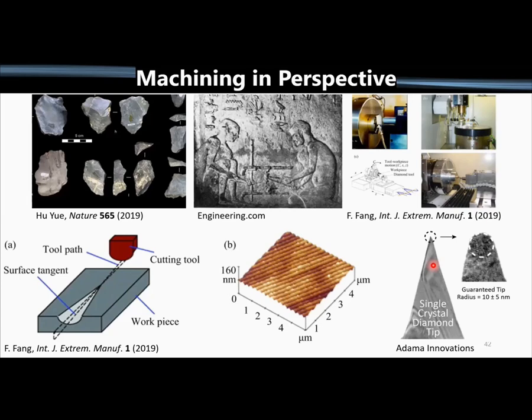So I also have a question about the nanomachining. When you do these structures, you obviously have to drag this material out when you're doing the nanomachining. So you don't see that it goes preferentially to the edges of these, for example, columns that you're doing, or it just goes to the side of the sample?